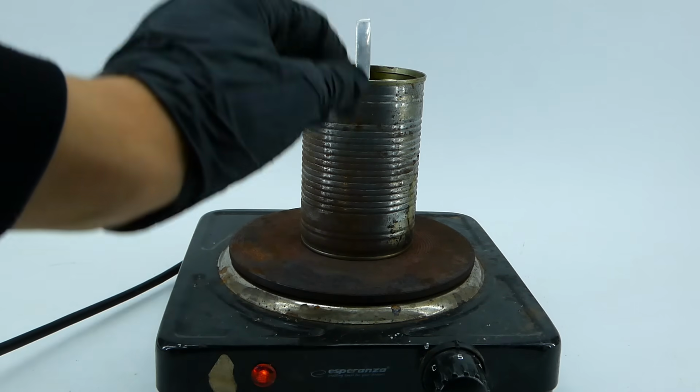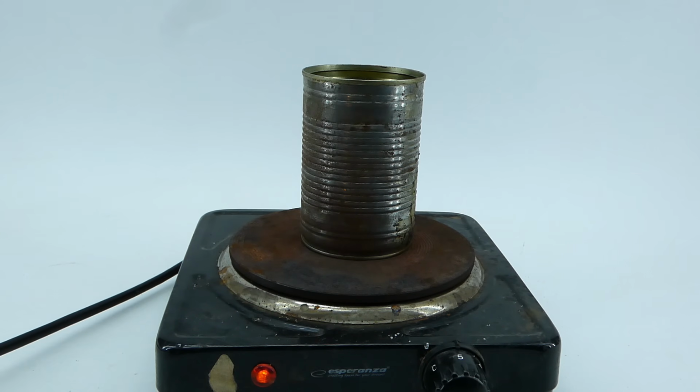This reaction only occurs when the sodium hydroxide melts, and its melting point is 318 degrees Celsius, and this temperature is much below that of my hot plate, so I thought that it would react quite fast, but after heating it for a while, nothing seemed to happen.